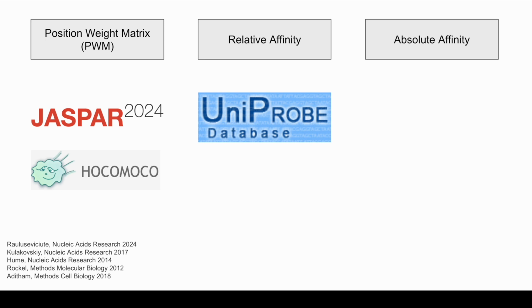And importantly, PBM correlates with methods that measure absolute binding affinities, which is our last category, and this includes techniques like MITOMI or BET-seq. These methods can also be used as reference datasets in this tool to measure the affinities of transcription factor binding sites.